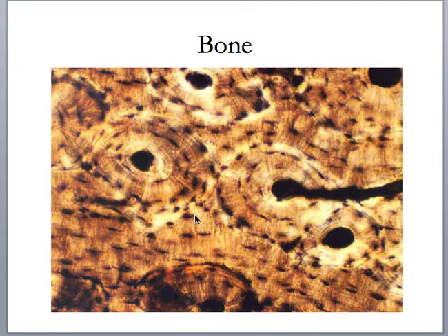So again, each one of these units, if I ask, what is this unit called, you would say an osteon. Now, if you look closely, you can tell that there are these concentric circles around this central canal. So in the middle of each osteon, this is called a central canal or a haversian canal. Either of those works for me for identification purposes. In the central canal or haversian canal, this is where you find arteries, veins, and nerves running through bone.